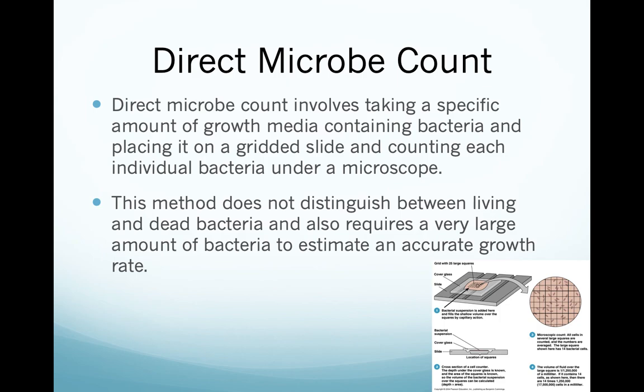What you're going to do is take a sample of, say, a liter of water from a lake, or 5 milliliters of blood or something like that, and count how much bacteria is inside of that original sample. Now, you can't really count all the bacteria in a liter. That's going to take you forever. Or 5 milliliters of blood might take you a while as well. So you're going to take a very small measured amount, maybe a tenth of a milliliter out of your liter sample, or a tenth of a milliliter from your blood.